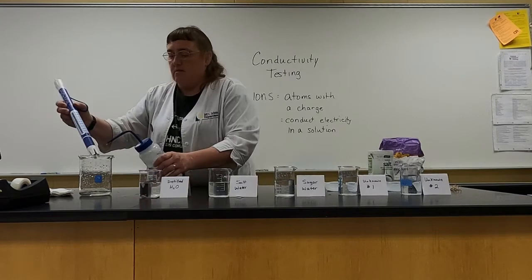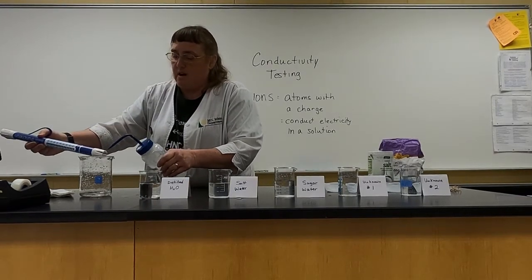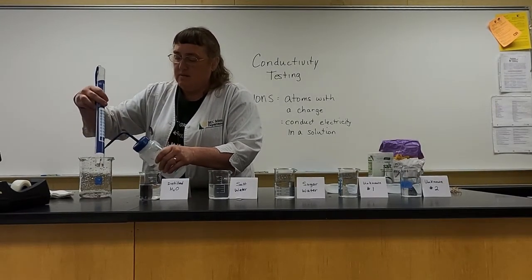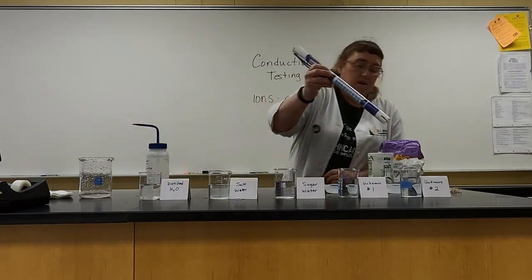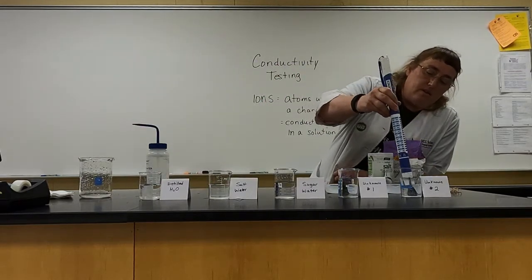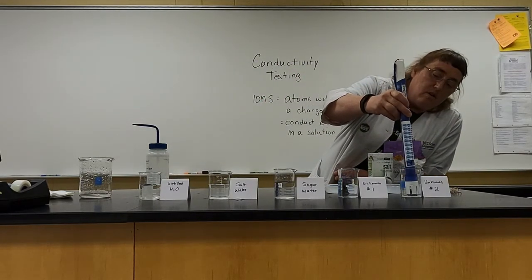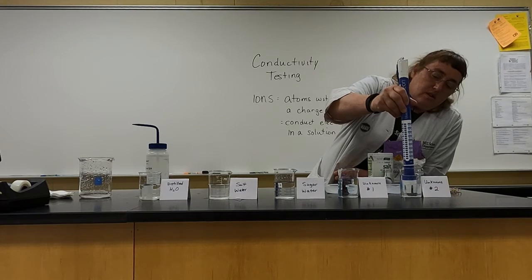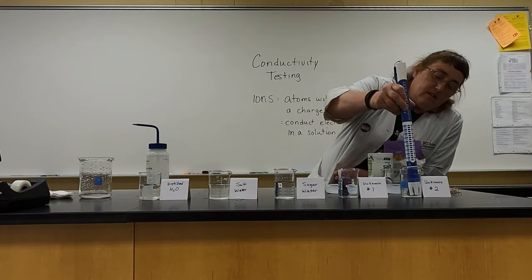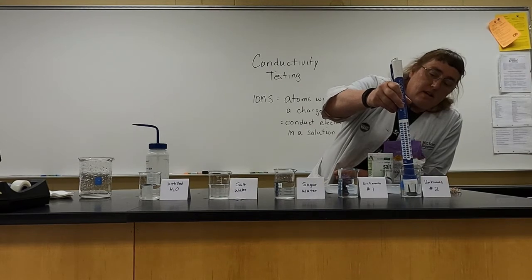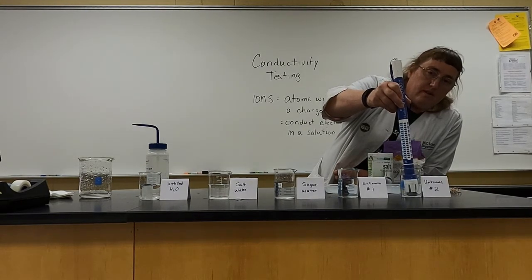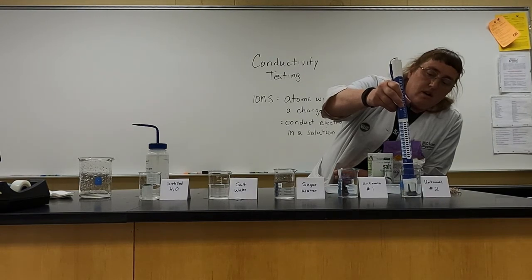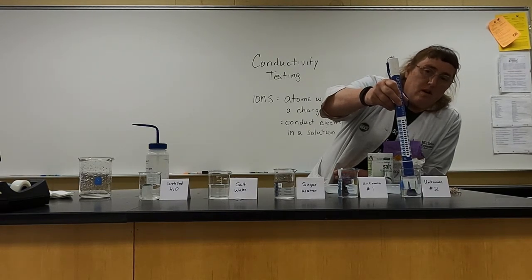Let's look at unknown number two. We're going to rinse this off to make sure it's not contaminated from the first one. Put it in number two — unknown number two doesn't look like it's lighting up at all. I don't see a single light. Can you guess what kind of solution or what kind of molecule we put into that distilled water compared to unknown number one?